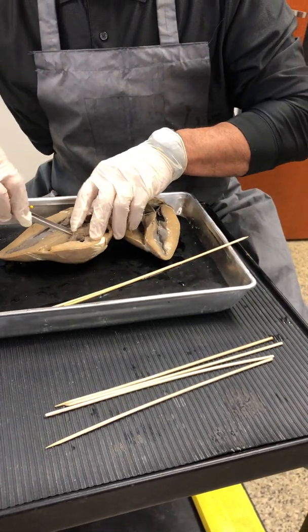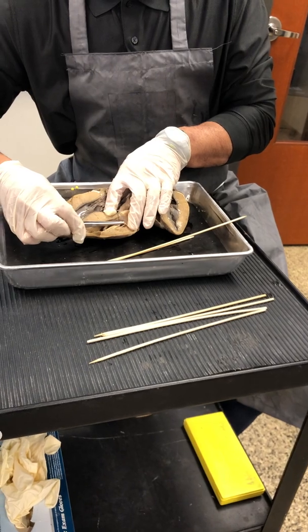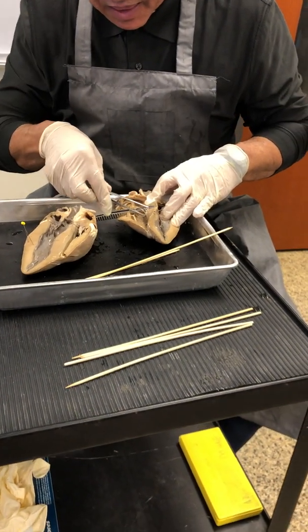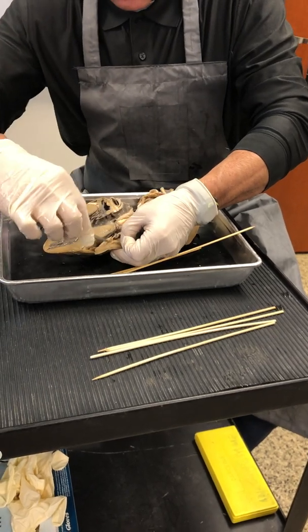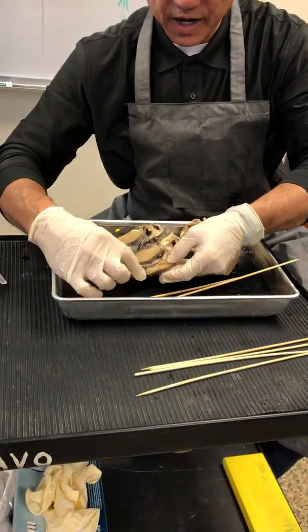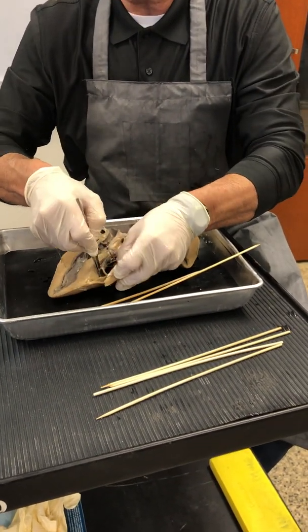Alright, so there you can see, remember three-dimensional organs, you've got to go both sides, right? Then, folks, the chordae tendineae are going to run onto these bumpy muscles right there. And what we call the bumpy muscles that the chordae tendineae are attached to is papillary muscle. So notice here now you're starting to review. So chordae tendineae onto papillary muscles right there. So now we are in the right ventricle right there.